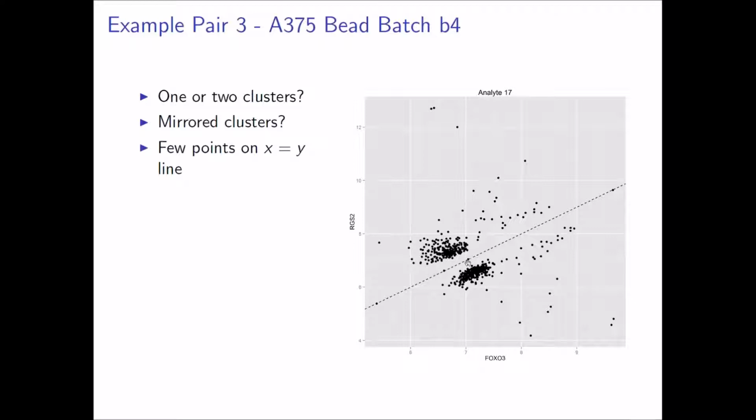It's interesting because there's only a couple points that aren't able to be deconvolved, and then there's this gap, which I think is common in the data. If the peaks are too close together, that just doesn't happen in the data the way that it's set up. So you get this gap.